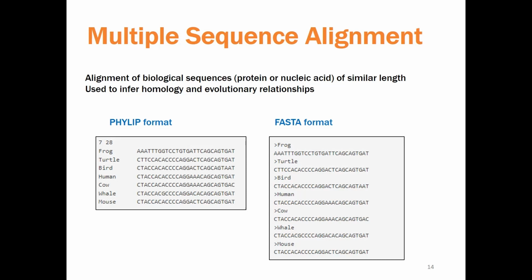There are different formats for multiple sequence alignment. Ours is in FASTA format, so it'll look something like that. But there are tons of different formats that you could create.